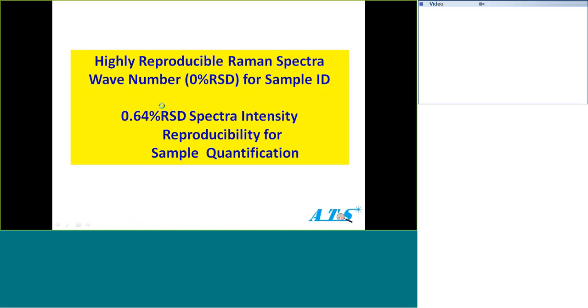So, and for near-infrared, that's even worse. When the size is different, you have to do a calibration curve for this size. When the size changes, you have a calibration curve for the other size. And when it's a ceramic bake, which is this thickness and that thickness, again, you have to do all the calibration. Raman, you don't need to do it, just one calibration, that's it, okay? The signal intensity is proportional to the amount of the chemical inside, okay?